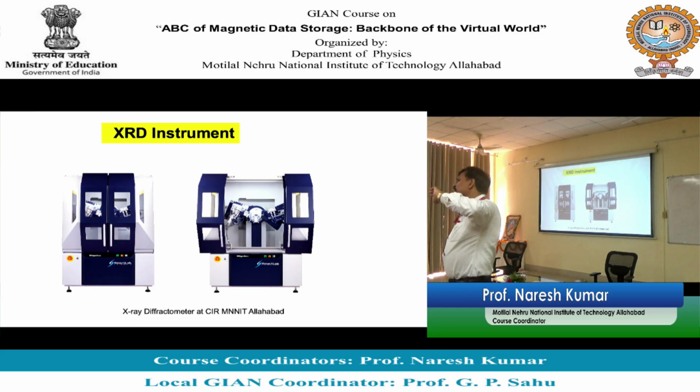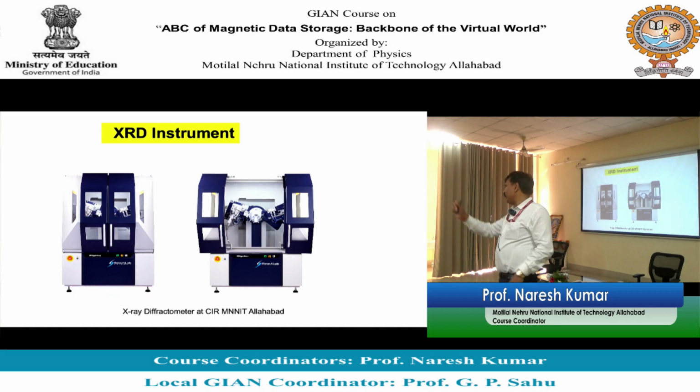तो बहुत पहले जब we started our PhD, our research, that time this X-ray was in open. सो बड़ा टेंशन होती थी हम लोगों को, लेड की शीट डाल के एक दूर ऑपरेटर रहता था. बट उसके बाद से चीज़ें बदली हैं. So basically this whole experimental setup or X-ray setup is enclosed in this box. जो box है ना, ये box it is of iron, और ये सामने दिख रहे हैं glass हैं. So they are not the ordinary iron and ordinary glass. They have lead added to them. So lead absorbs the X-rays. तो यहाँ पर एक light लगी रहती है ऊपर.